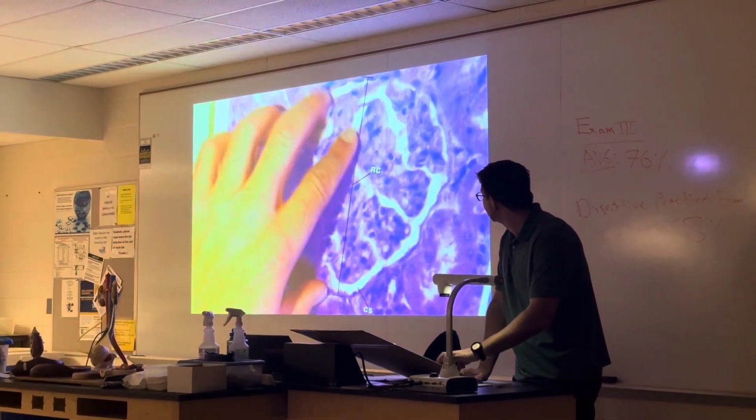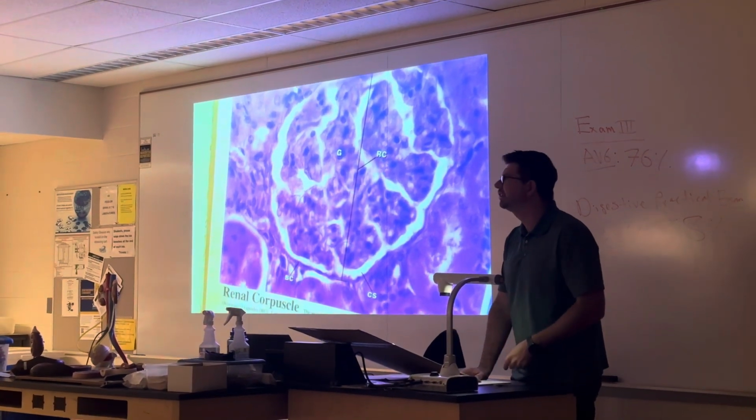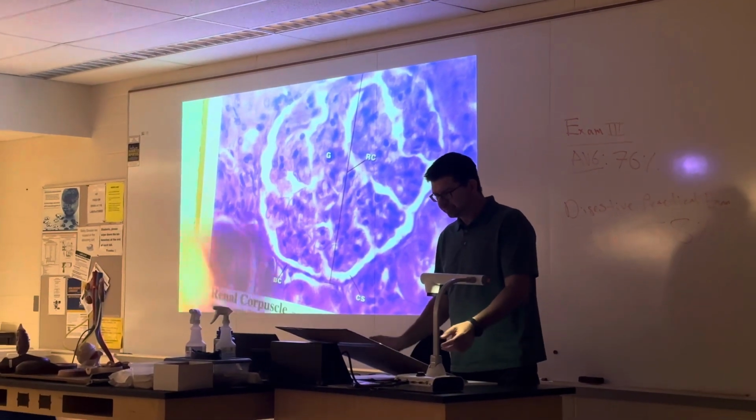So I could have either glomerulus on a picture like this, or Bowman's capsule. And again, just like all the other styles, there will be an arrow pointing to the structures for you.